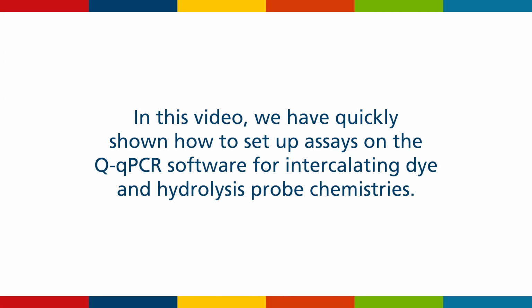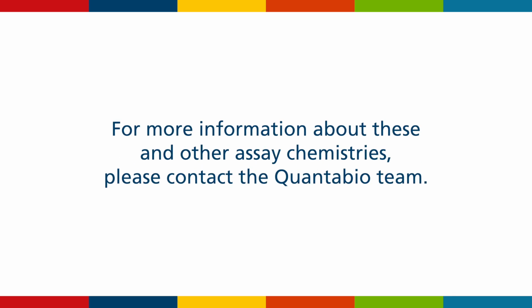In this video, we have quickly shown you how to set up assays on the Q-qPCR software for intercalating dye and hydrolysis probe chemistries. For more information about these and other assay chemistries, please contact your Quanta Bio team.